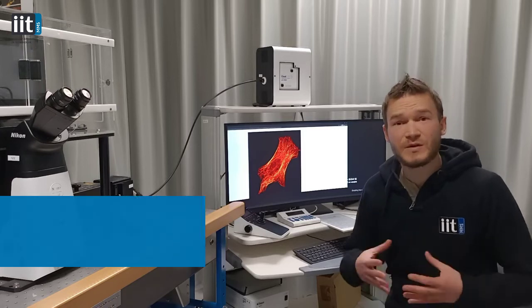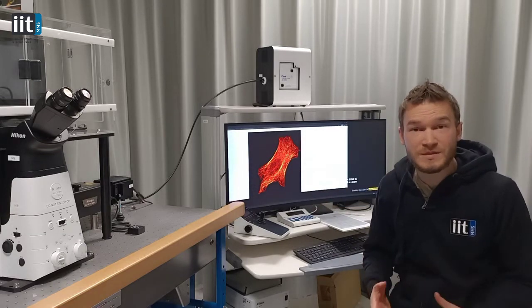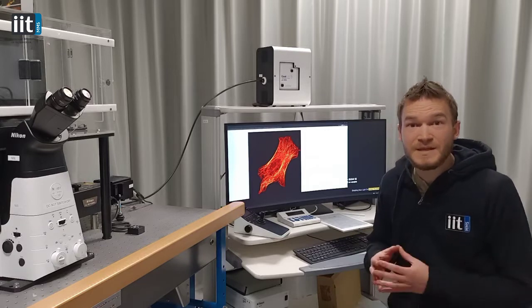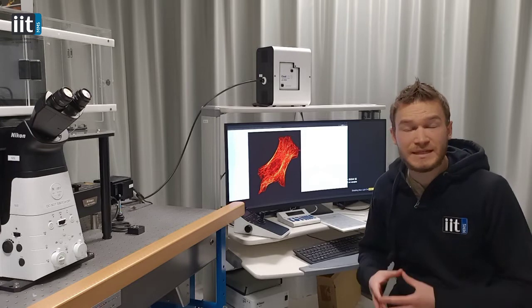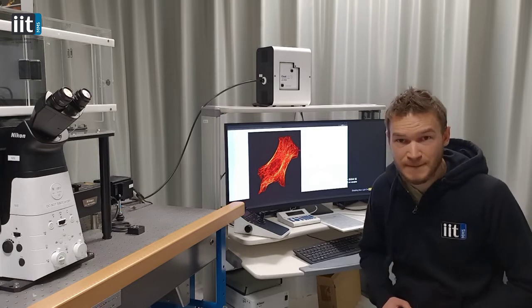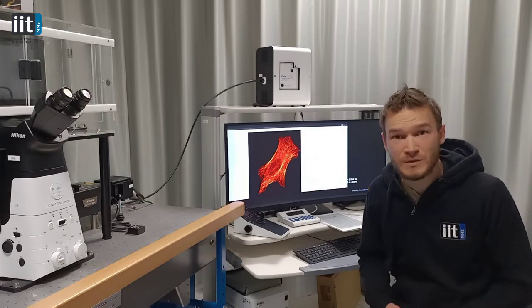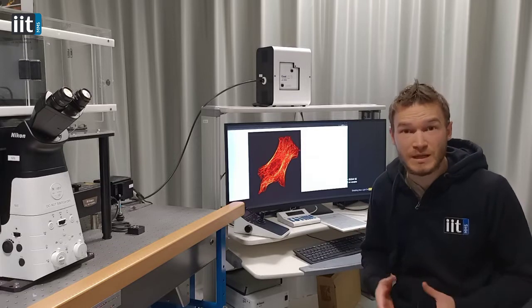A cell is an incredibly complex structure with a huge variety of biomolecules that are densely packed in all kinds of sophisticated arrangements. For example, here you see microtubules, which are formed by tiny little proteins that we imaged with a fluorescence microscope. These proteins form the cytoskeleton of the cell, and they are crucial in all kinds of cellular processes. Now, cells and the biomolecules they contain can be incredibly small, down to a millionth of a millimeter, which is why we use microscopes to visualize them.